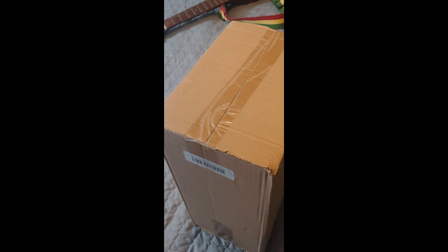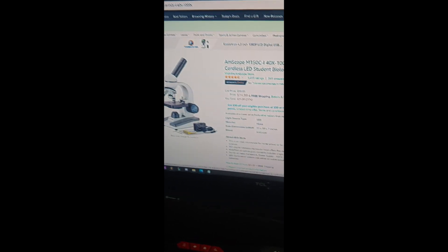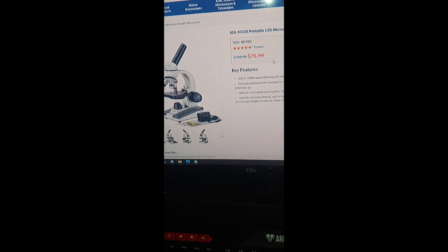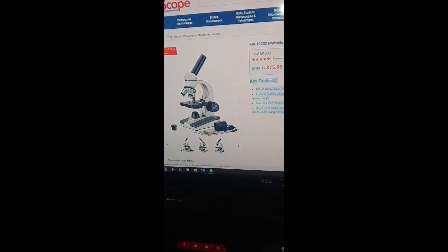What's up y'all! I'm going to be doing the unboxing of this AmScope M150C microscope. I got it on Amazon for $74.99 — I do have Prime so I ordered it and it got to my house like two to four hours later. This is the AmScope website where you can get it as well.